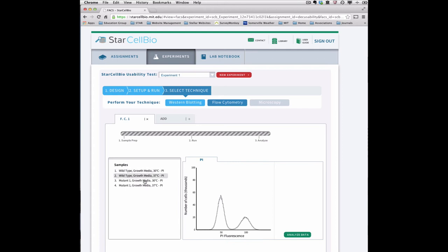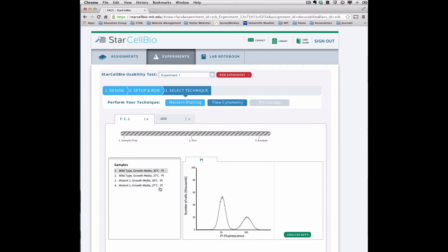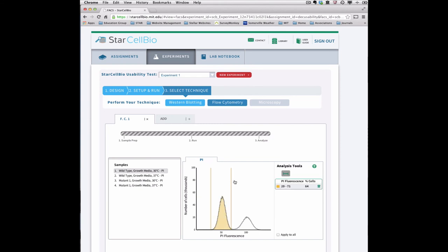To create and analyze the percentage of cells within segments of the histogram, use the Histogram Analysis tool. First, select the Histogram Analysis button, and then click and drag your cursor within the flow cytometry graph to create a segment. Repeat this process to create more segments as needed. To apply the same analysis to all samples, select Apply to All.